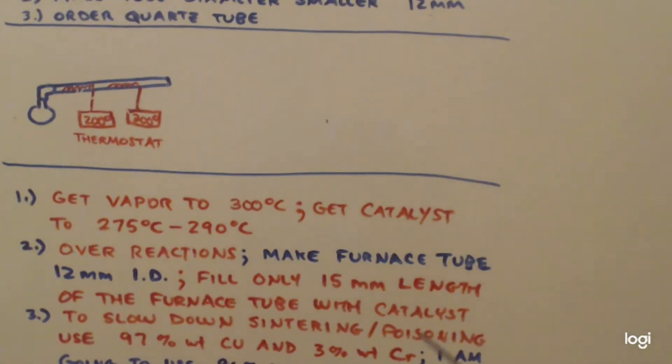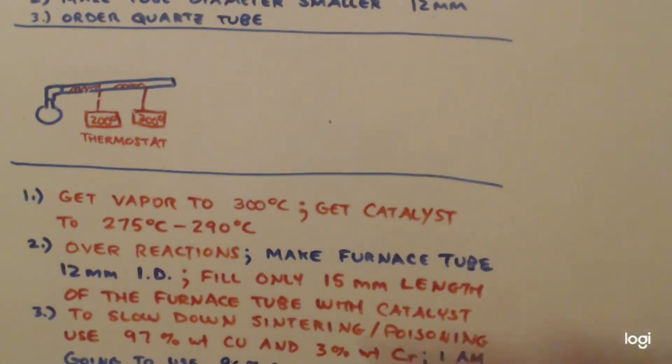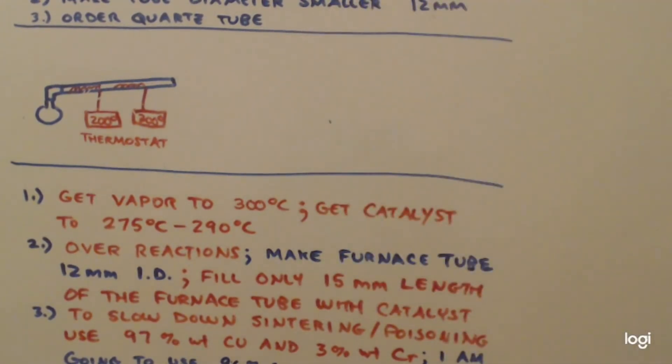Now, the catalyst — I want it to be between 275 and 290°C, and I'm going to set my thermostat at 275°C. Remember when I said there are four problems you want to overcome to get a good yield? This is the first problem. Instead of guessing like I did over 10 experiments, I'm going to actually know for a fact that I'm getting the temperature I want. After I do this with water, I'll connect this up with a trap so the vapor doesn't come out and create a hazard, and I'll use ethanol to make sure the ethanol can also get up to 300 degrees just like the water did. Then I will have number one taken care of — I'll have thermostats and experimental proof that it is the temperature it is.